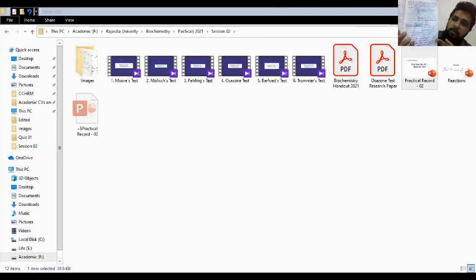Yes, it's better if you can draw the figures, and chemical structures. And now under observations, you have to draw the structures of the osazone.